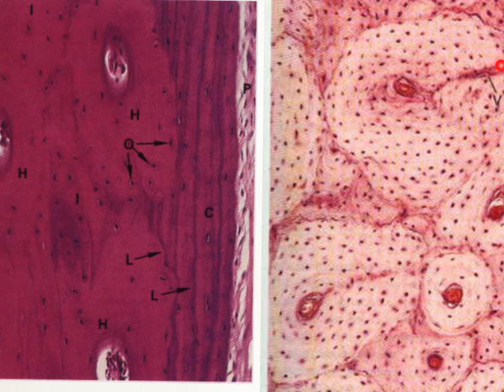If you have a label for this blood vessel, it's better not to mention Volkmann canal, because it is the anastomosing vessel passing in the Volkmann canal, and I cannot see the Volkmann canal, which is a calcified tissue, in the decalcified compact bone section. So it's better to say anastomosing vessel passing in between two Haversian blood vessels. It's better than mentioning the name of Volkmann canal, or it's more correct.